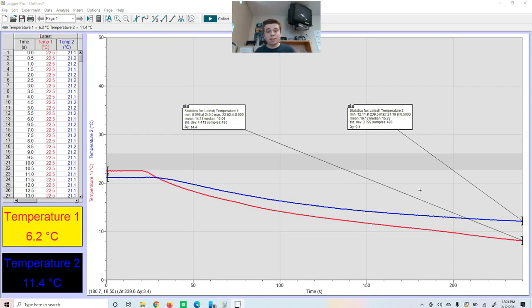I'm going to get the next experiment set up, so keep working on this problem, and then we will start our third trial here. I'm back, and we're going to start our trial 3. For our third trial, we're going to look at acetone versus 2-propanol, or isopropanol. We're going to put the acetone on the yellow one, and the propanol on the black one.